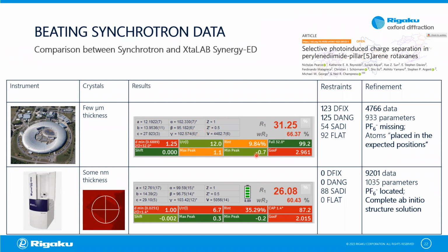As you can see, they got a resolution of 1.25 angstroms and good completeness, R value beyond 30, and accordant data. And with this data, they were able to refine a best guess model. The atoms were placed in the expected positions from theoretical calculations, and they then refined this best guess model by using quite a lot of restraints and constraints. And well, they got a result.